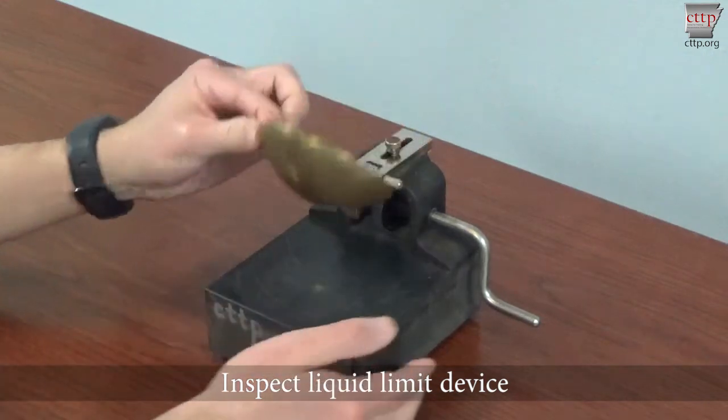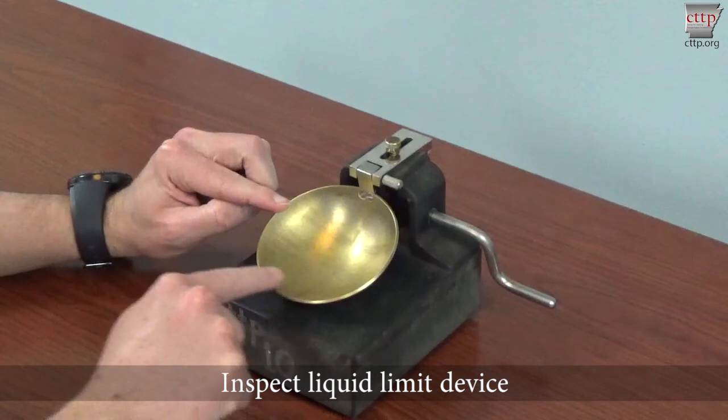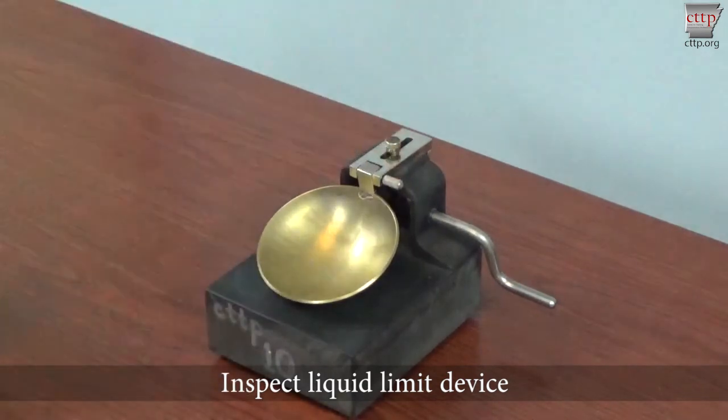Wear areas include the grooving line and front rim of the cup. When an indentation or groove in the cup surface can be felt, it is time to replace the cup. Check the two connecting screws that hold the cup to the hanger arm for tightness. Check the cup for side-to-side play, indicating that the pin that holds the cup to the machine is worn.